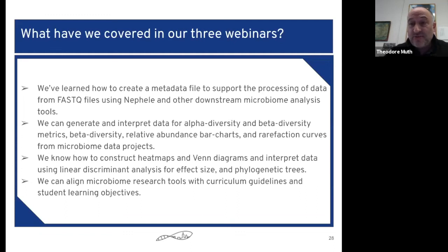That's another exciting tool if you want to look at the metabolic potential of your microbiome sample. That's really cool. The Explore pipelines also give you the additional QIIME 2 outputs that we can come back to at a later point. And then we started to actually get into the data with the outputs from the DADA2 pipeline, looking at rarefaction curves and alpha diversity, the 2-dimensional PCoA plots and bar charts and so forth we got into today.